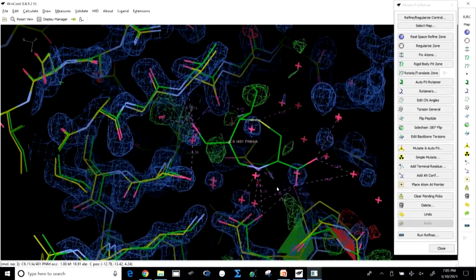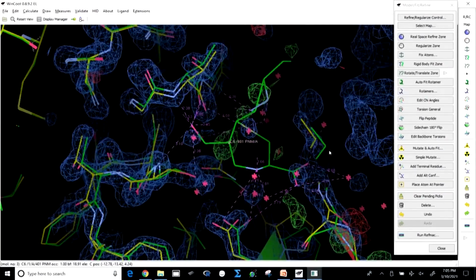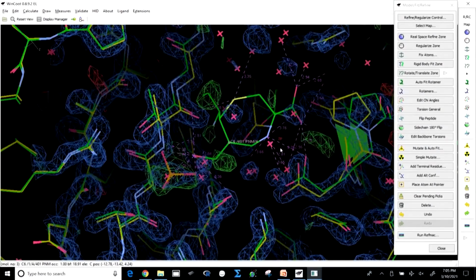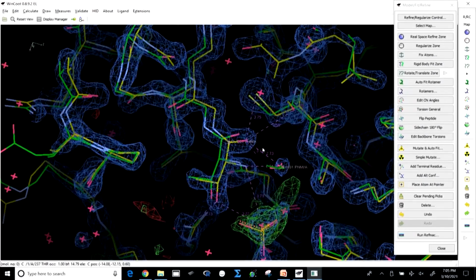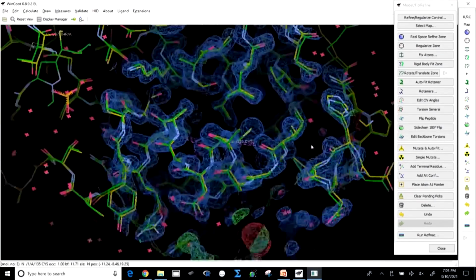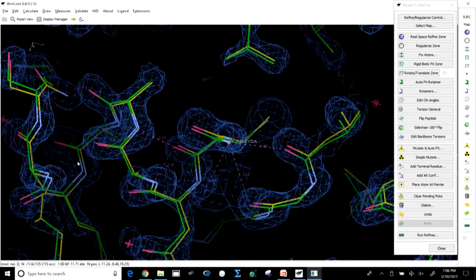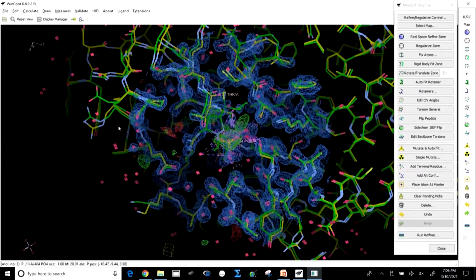You see the protein has a lot of interactions, right. Because of these interactions, you see there are changes in the position of the amino acids. So, that is what you could find, how they are different, how they are interacting, all these things you could get from here.